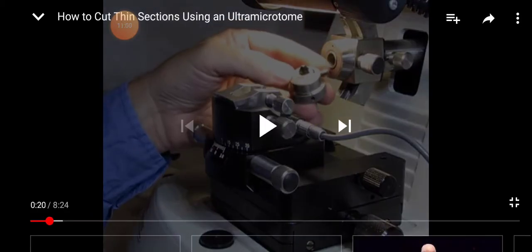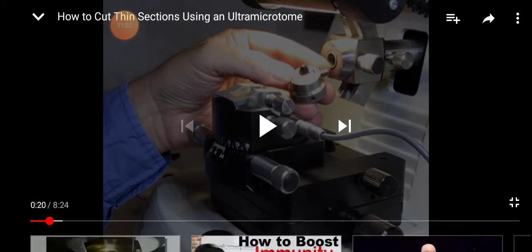So in electron microscope, when we take samples for electron microscope, sections for electron microscope, we do not embed it in paraffin wax. We embed it in epoxy resin. So you can see in this video that object holder, which is containing a small black material, that is the epoxy resin which is containing our specimen. Okay, that is the specimen embedded in the epoxy resin.